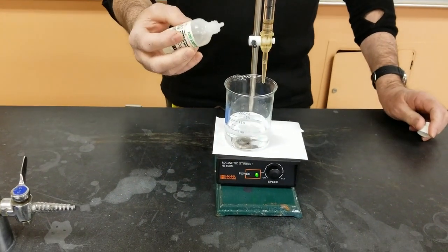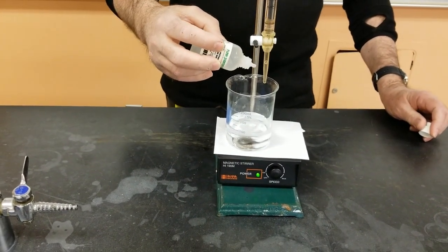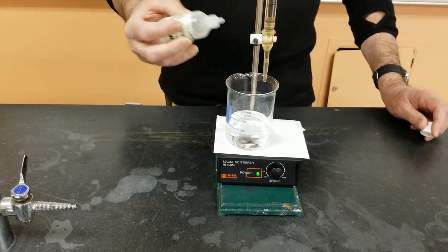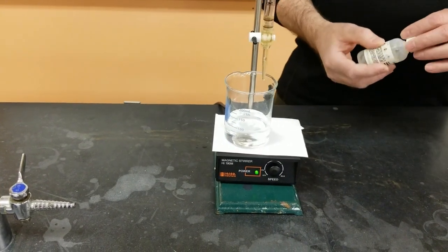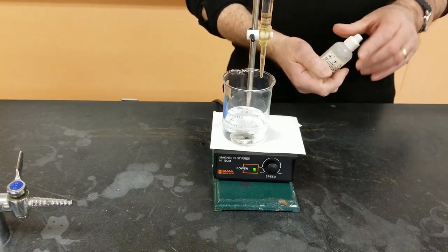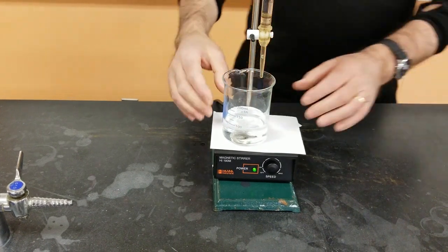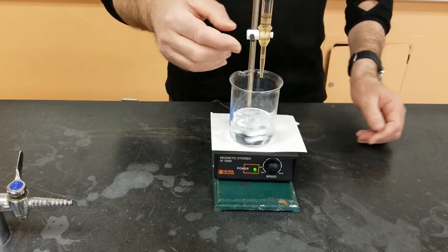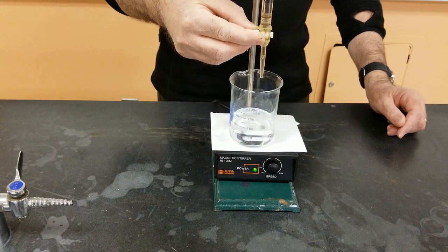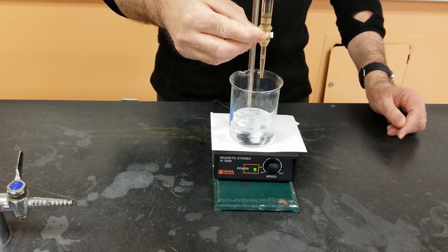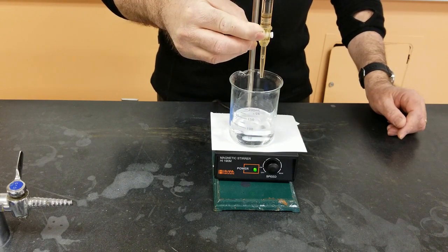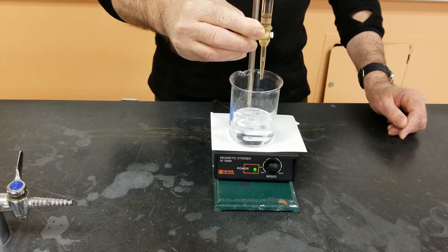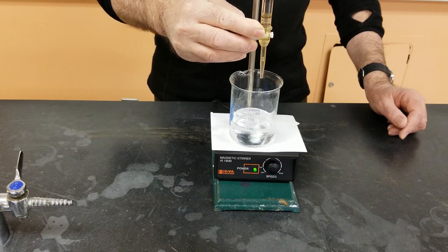So right now I'm going to add a couple of drops of phenolphthalein to the acid. And you'll see that it remains colorless because there's lots of H+ in there. Okay, so now I'm very slowly going to start adding the NaOH to the KHP and just let it drip in kind of at a steady pace.